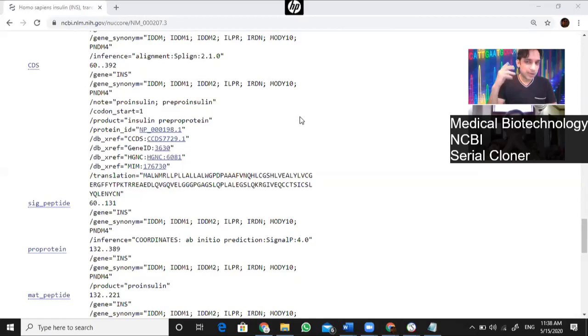So when you heard something like in the last class, there is a separate website for the consensus CDNA sequence. Many of us already started believing वहां जाने का फायदा कोई नहीं है, मुझे वो आता नहीं है. I might not be able to get things out of that website. Some of us might be thinking in a different way. वहां चल के देखते हैं वहां पर क्या होगा, try करके देखते हैं क्या होगा. Let's see. So just be like that one, okay?